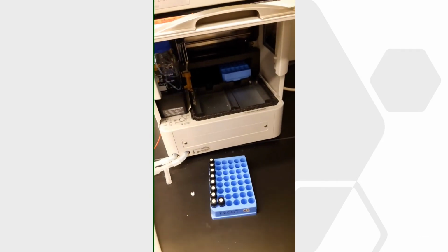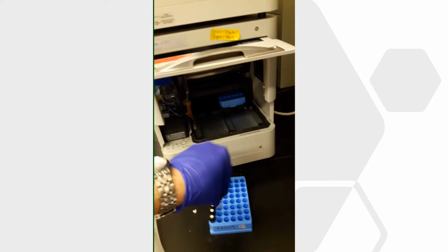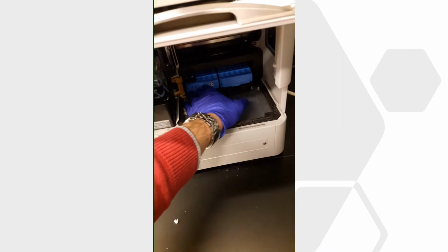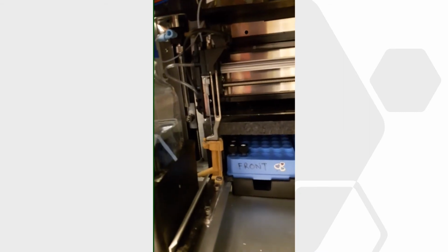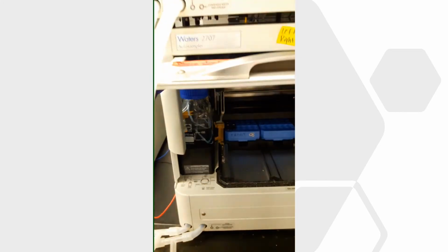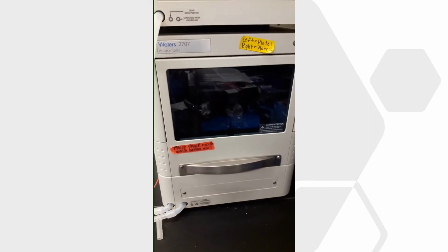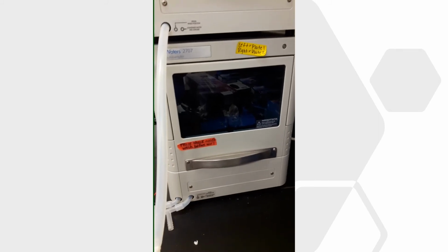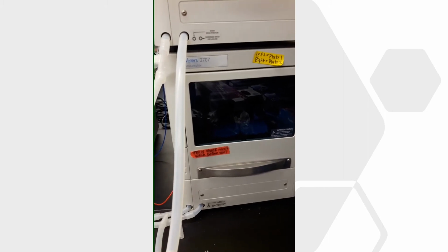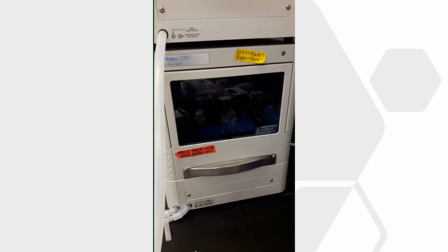Here we have our samples rack, and we place our samples in an HPLC vial like this. We put the rack in its proper place, and here we have the needle which withdraws the sample and injects it into the mobile phase. We have to close the door before starting our sample injection and analysis. This is an auto sampler, so we don't have to inject samples one by one. Instead, we program our software to run a full sequence of samples that can, in this model, be up to 96 samples.